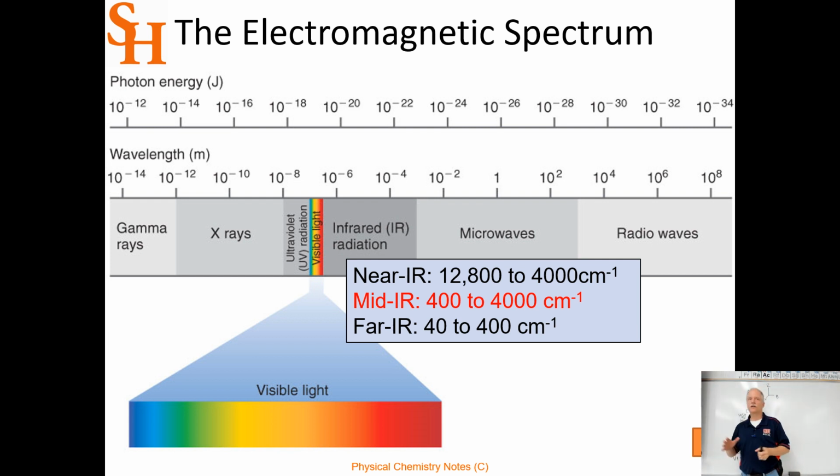If you get to larger molecules, you might see more very low frequency peaks in the far infrared, and that's the 40 to 400 wave number, but you need a completely different spectrometer. We can't do that with our spectrometer. And then if you get into the near infrared, 12,800 to 4,000 wave numbers, we can see that, but we don't have a near IR source. But those would be your overtone spectra, and you can get some material properties from the overtones, but not as easily understandable as the mid-infrared. So that's where we are.